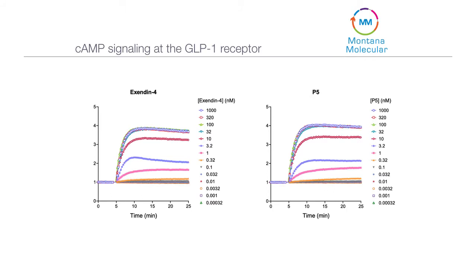cADDis assays for cyclic AMP make great tools because of the high temporal resolution and high signal-to-noise. This data is collected in collaboration with Patsy McDonald's lab at the Moffitt Cancer Center on a BioTek Synergy MX fluorescence plate reader.